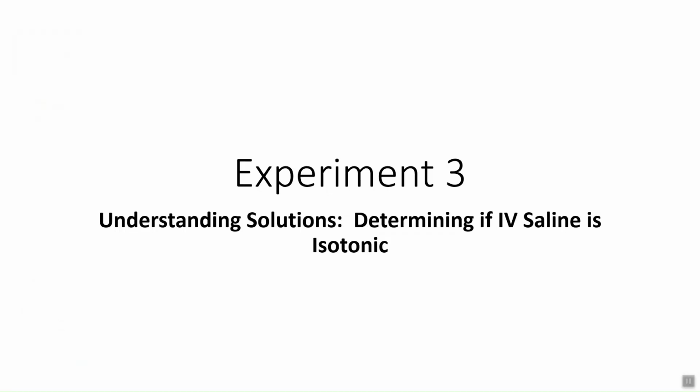Hi everyone. So in this video, we're going to go over understanding solutions, determining if IV saline is isotonic, and we're going to use a calibration curve very similar to a previous experiment. So that's kind of that.